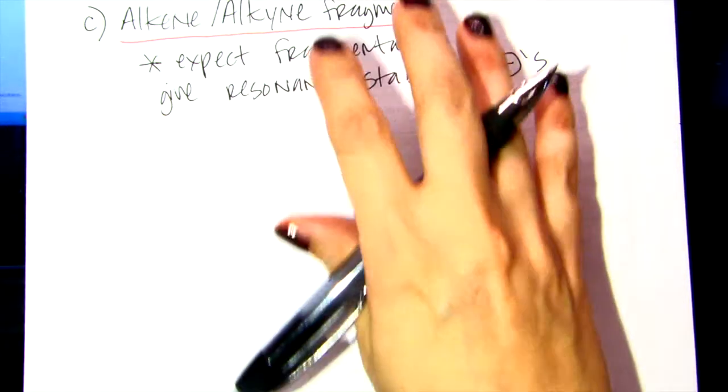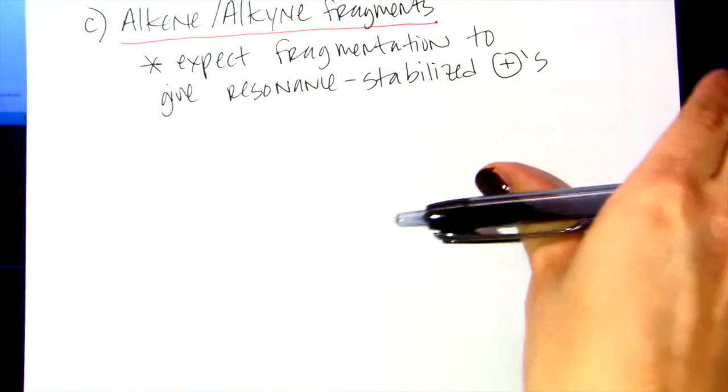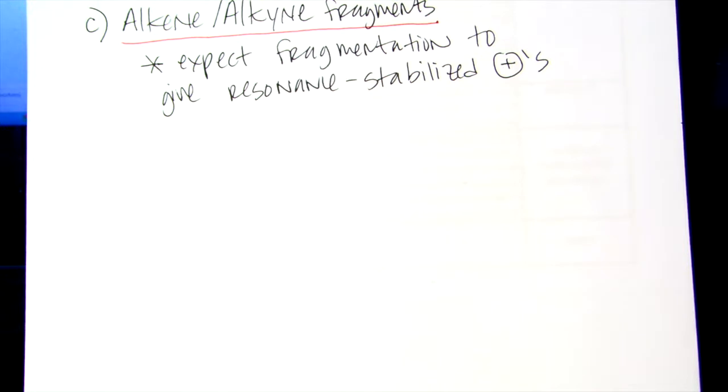Okay, so that's kind of all the information you can gather from the mass spec, at least for this class. There's more, it gets more complicated, but this is all you guys need to think about. And so we have enough information, mostly just from the isotope patterns, to solve a molecular formula. That's the application of thinking about all of these things.